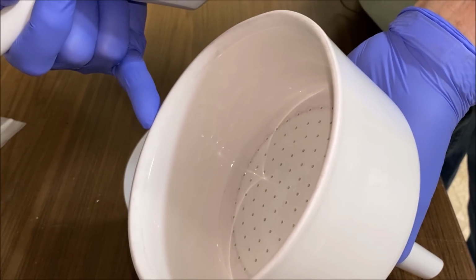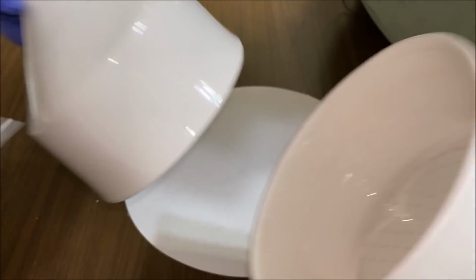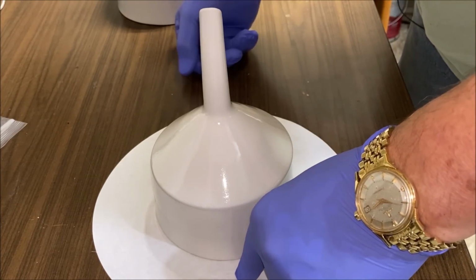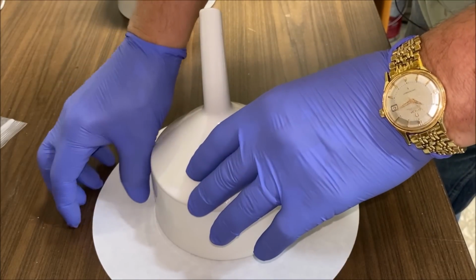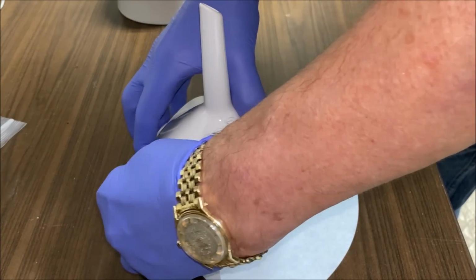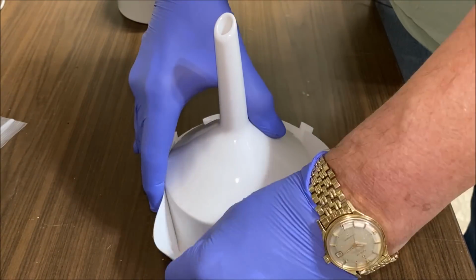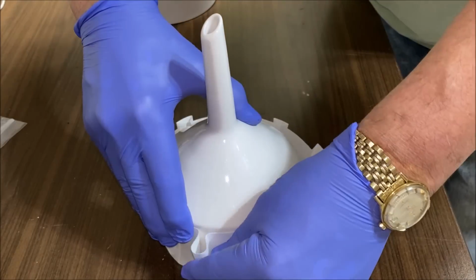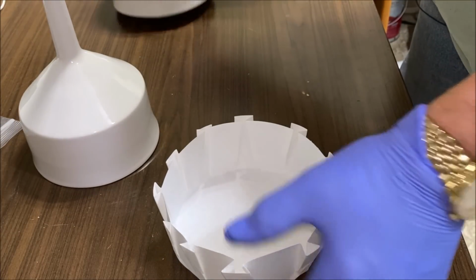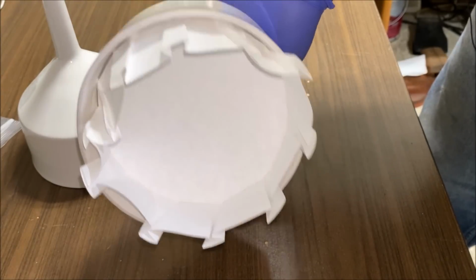What I have here is a 12.5 centimeter Buchner funnel, an 11 centimeter Buchner funnel. Notice it fits in there nicely. So what we do is use the 11 centimeter Buchner funnel onto a piece of 24 centimeter filter paper, and I just go around it like this and fold it all the way around. And here we have the properly folded filter paper that will sit right down into our 12.5 centimeter funnel.